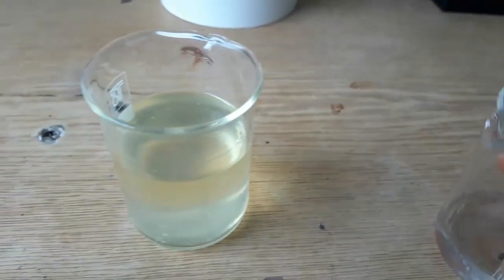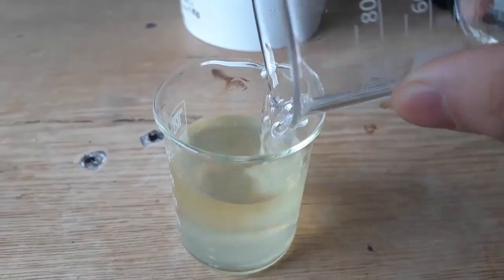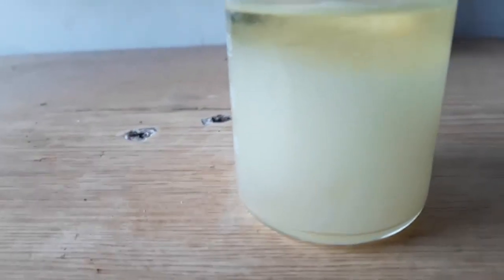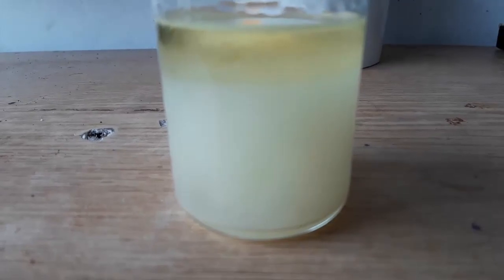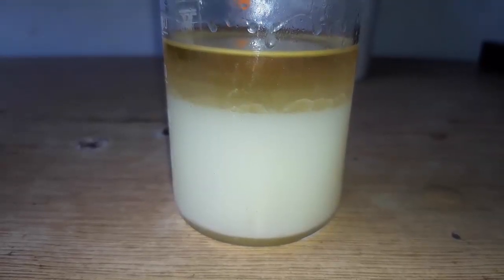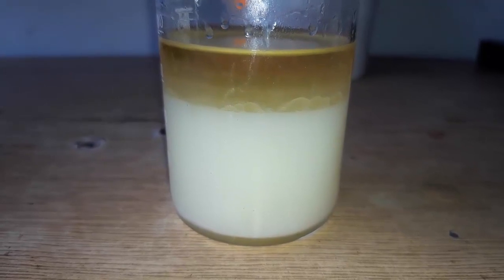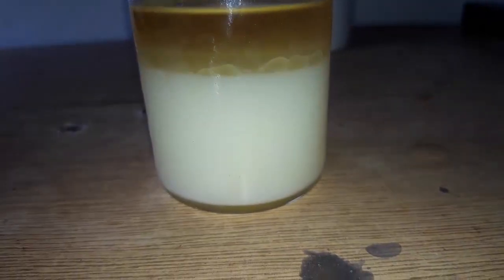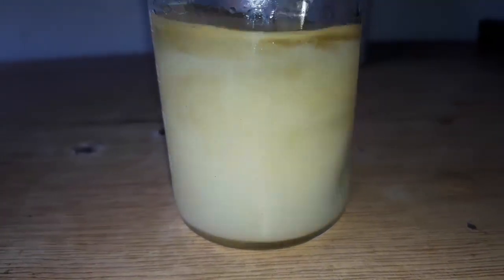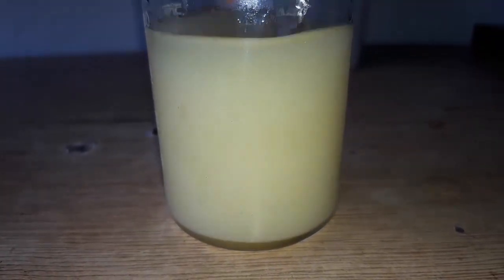We rinse the beaker with a bit of water and add that as well. After 15 seconds you can already see the solution separated into two layers — the top one is bright, almost neon yellow, while the bottom one is white.